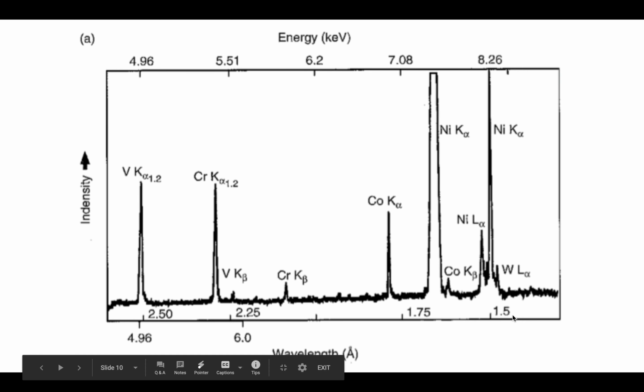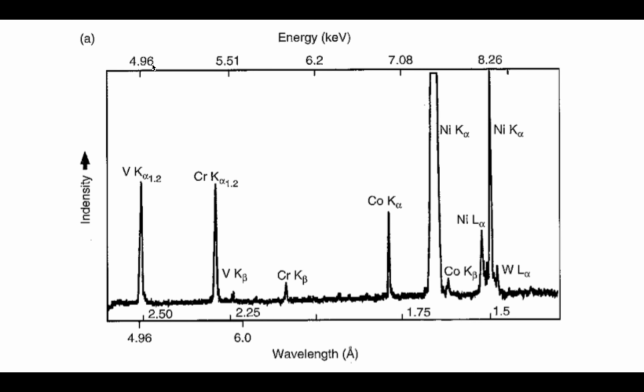But if you look, you'll see the wavelength is increasing from the right over to the left, whereas the energy, which is plotted up here, is increasing from left to right. And so you'll sometimes see that they're both plotted, even though, again, the W in the technique stands for wavelength. So that's the first thing that you'll want to keep in mind.